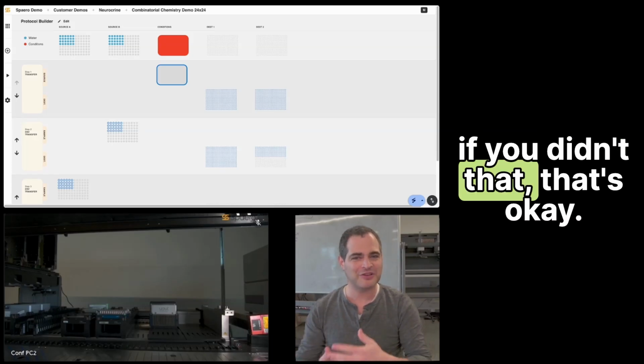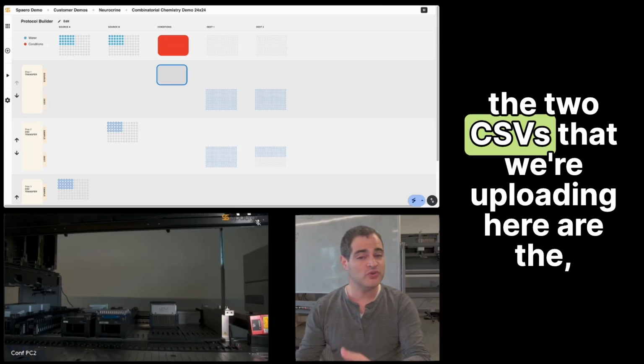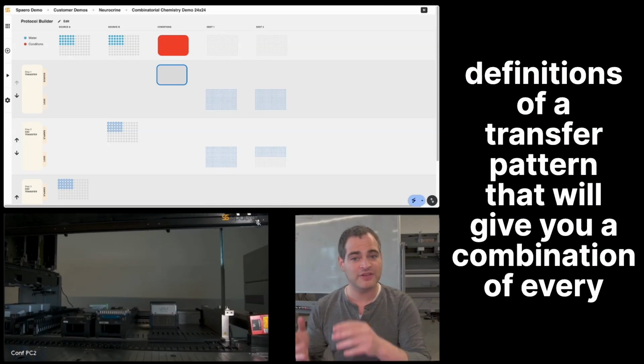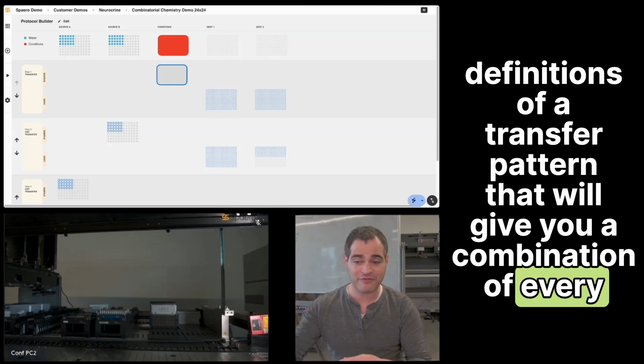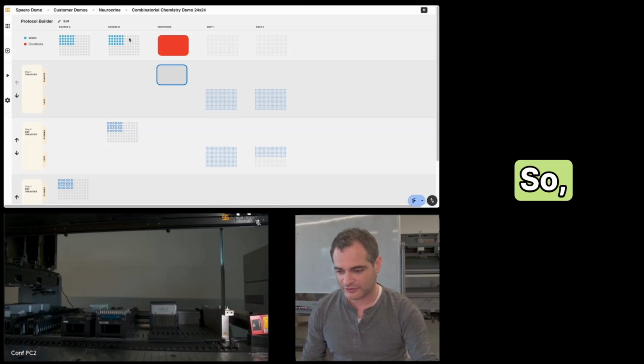If you didn't follow that, that's okay. The core thing to take away is that the two CSVs that we're uploading here are the definitions of a transfer pattern that will give you a combination of every well in source A with every well in source B. So how do we do that?